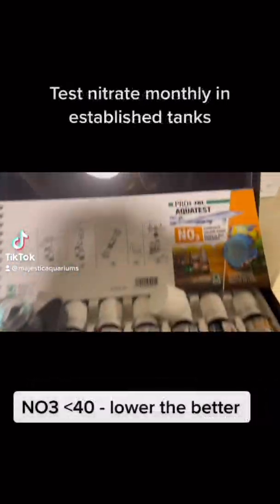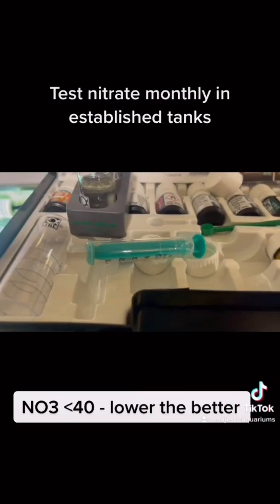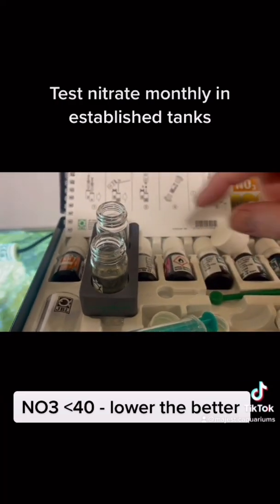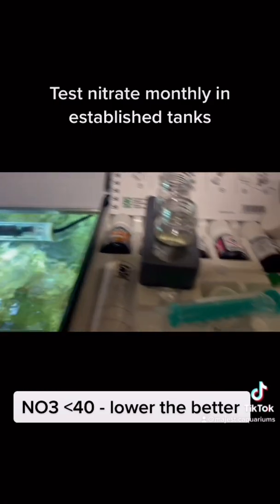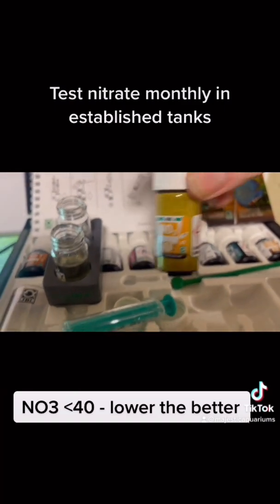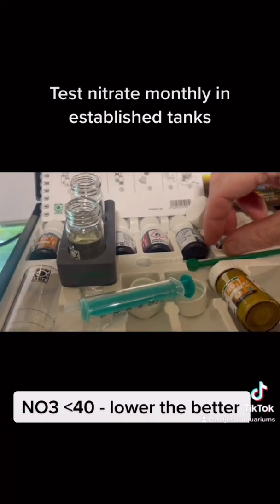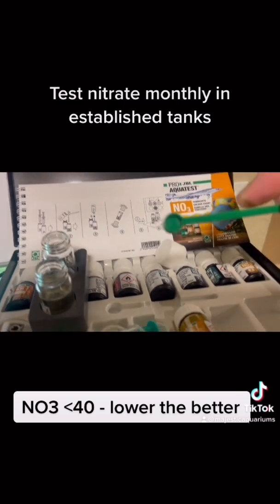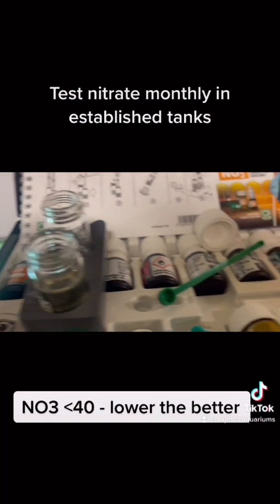Next we're going to check the nitrate. NO3 is nitrate. So the way we're going to do that is we're going to put 10 mils, not 5 mils like the other ones, into this one. Then we're going to get the powder, which says NO3 number 1, and it says scoop. So that little scoopy sign. Then we're going to grab this scoop and put that into here. Then we give that a little shaky shake.